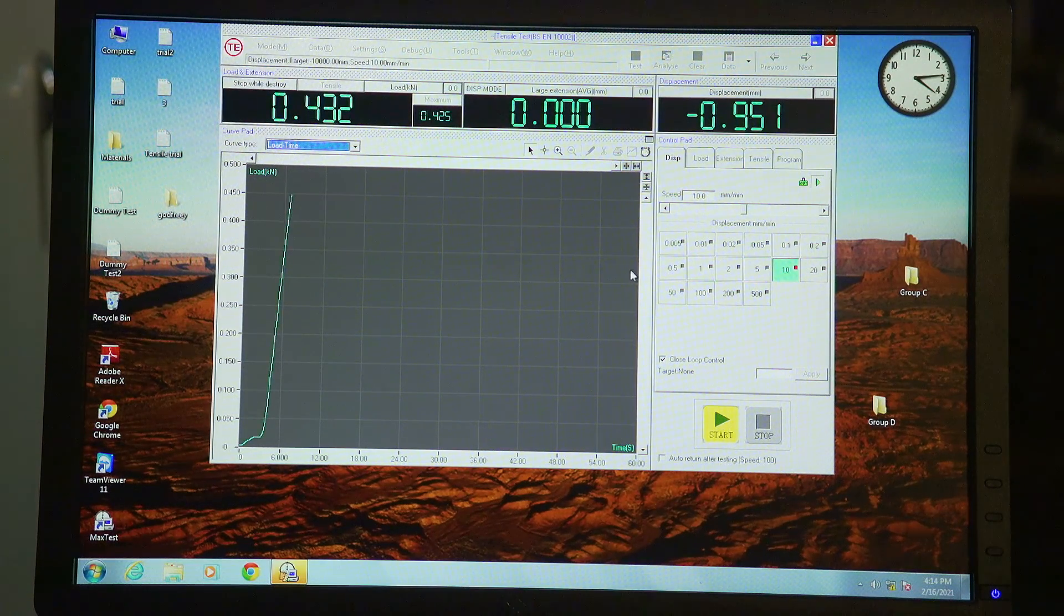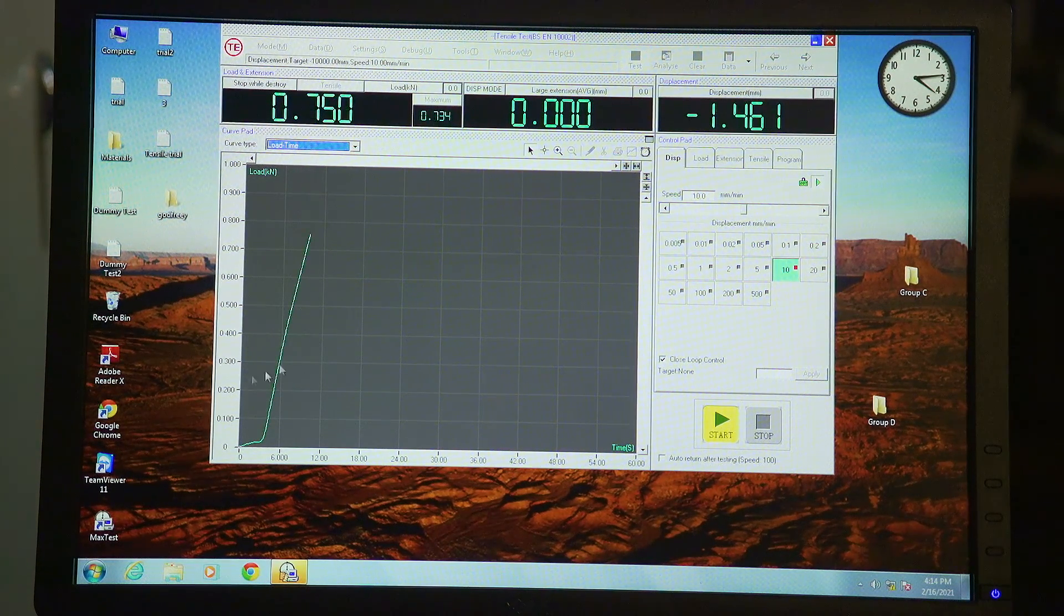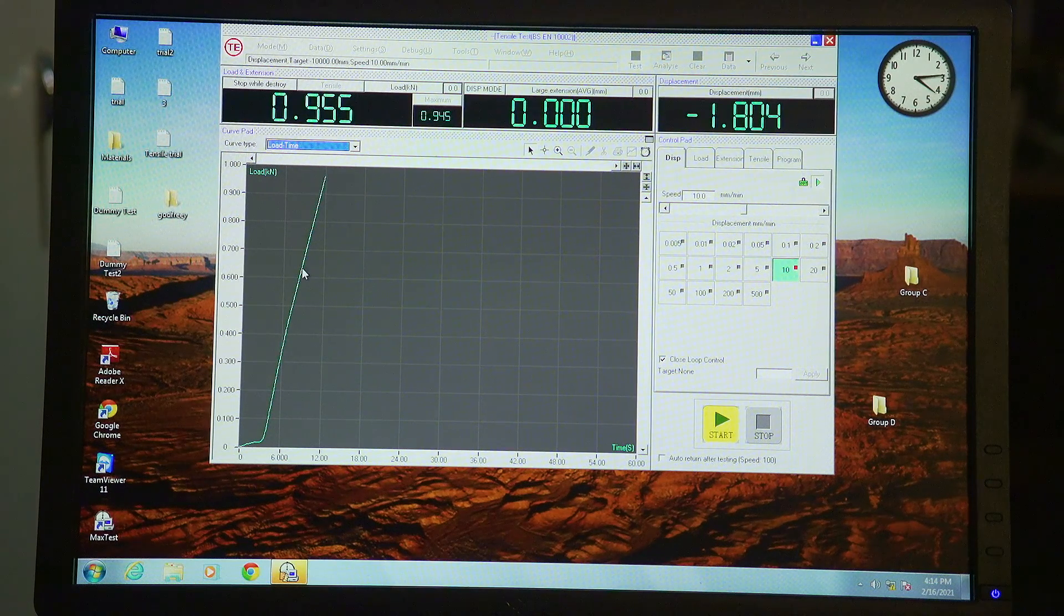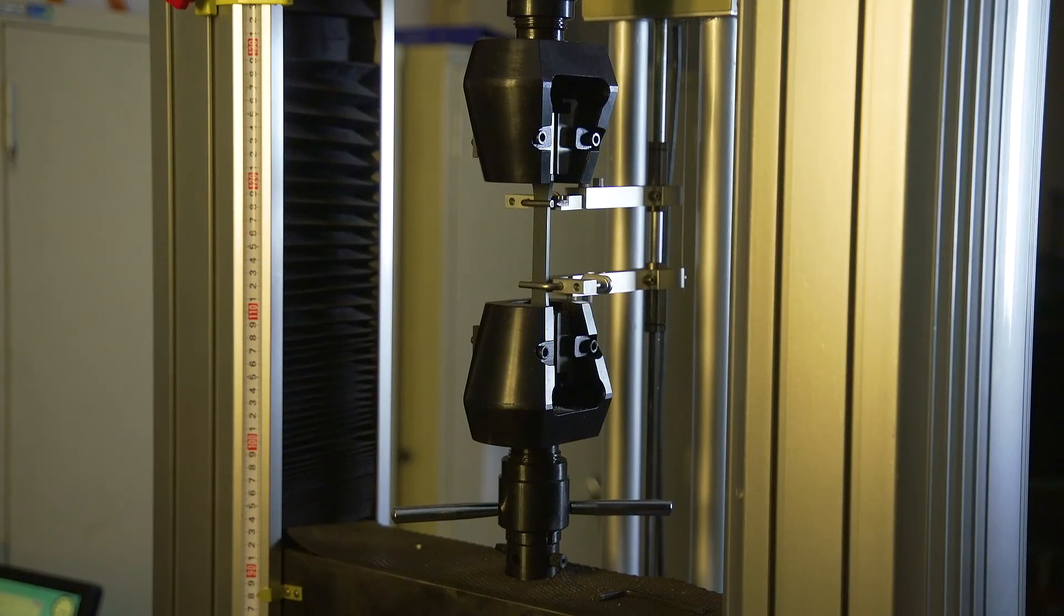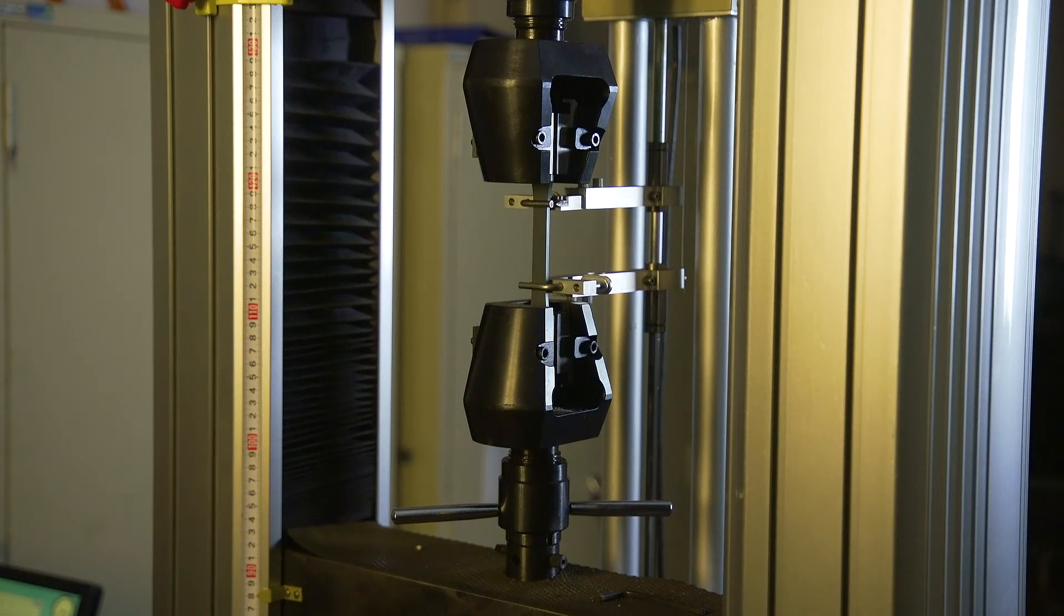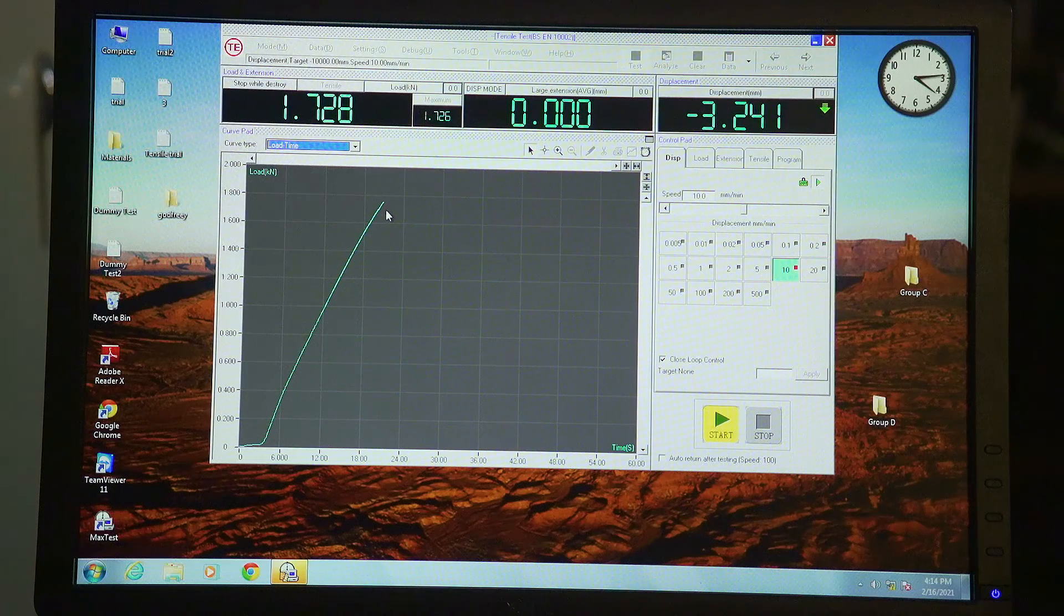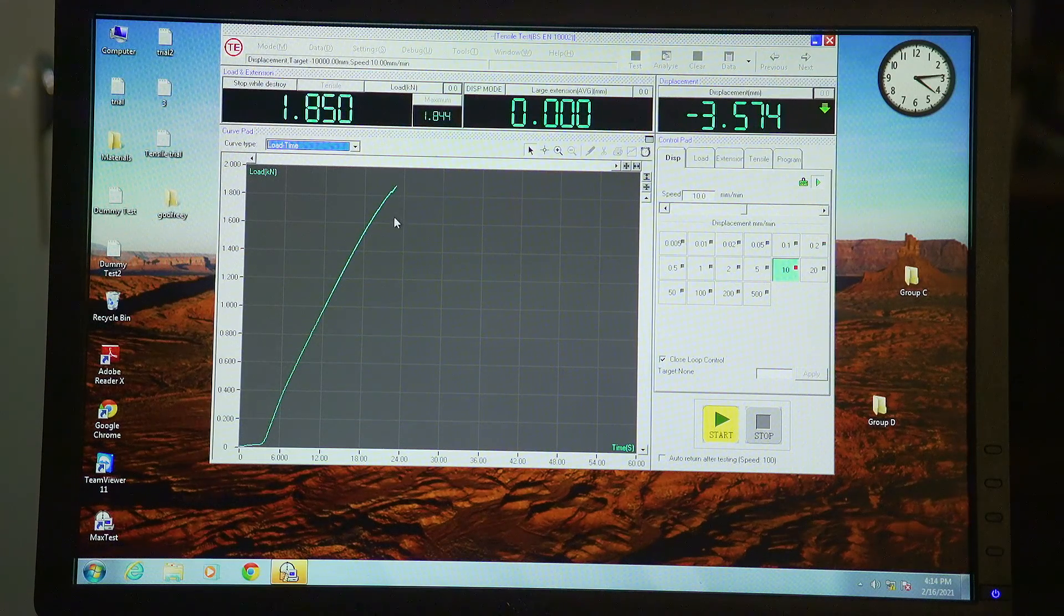As can be seen, the initial portion of the curve is elastic, and then we're going to get to a point where the material starts to plastically deform or shows non-linear deformation. At this point, I need to go and remove the clip-on extensometer.